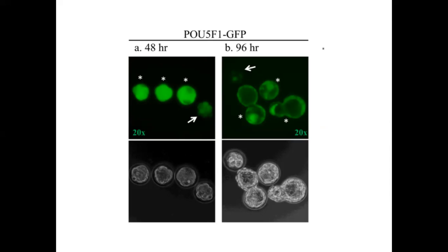And at 96 hours, we will also check the localization. It should normally be mostly localized at the ICM. Also, you can see on the left corner, the one half is poor in morphology as a blastocyst, and it also shows less green fluorescence.